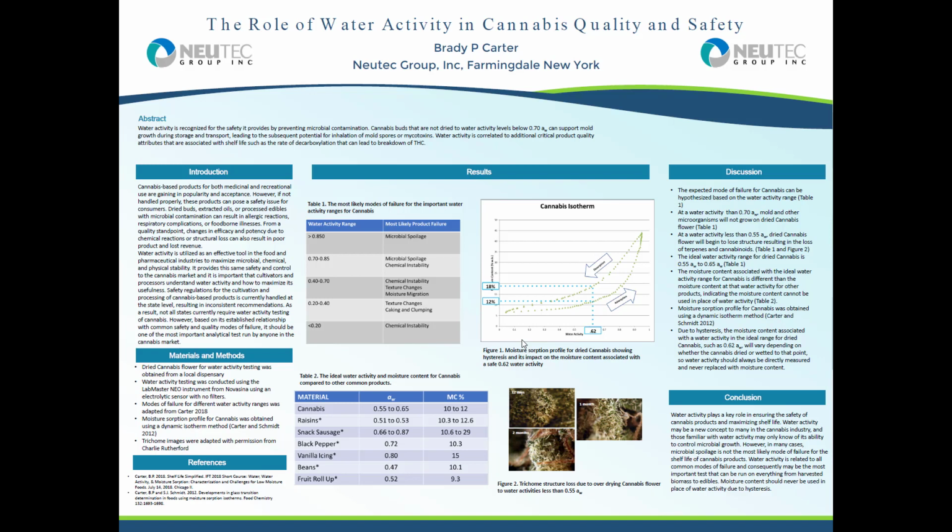So water activity is the energy of water in a product. It is not the free water. It's not the available water. Although those terms are used often, it is actually the energy of the water as derived from fundamentals of thermodynamics. And so it's important to understand that distinction, because the reason why water activity does what it does is because it is showing the energy.